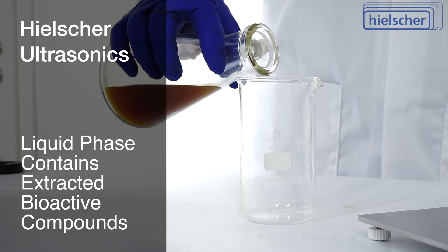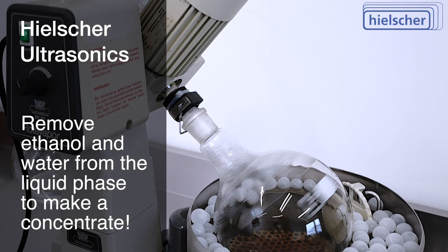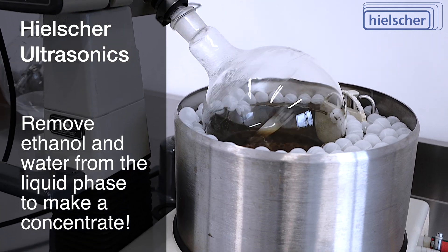The liquid phase contains the extracted bioactive compounds. To make a concentrate, you can use a rotovap to remove alcohol and water at mild temperatures.